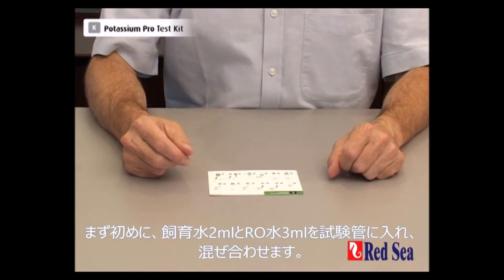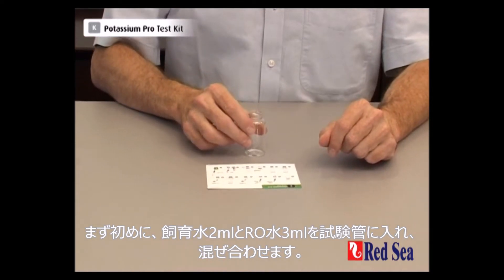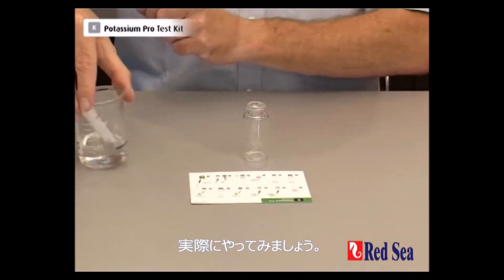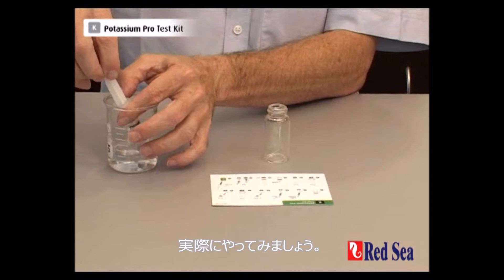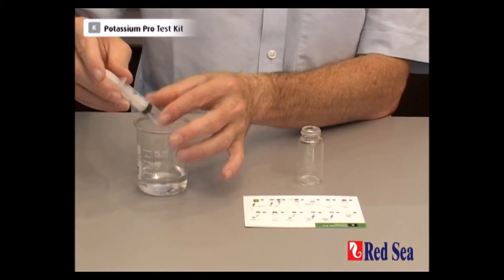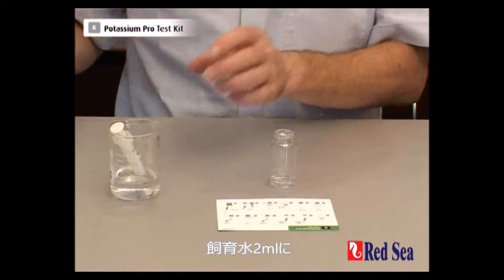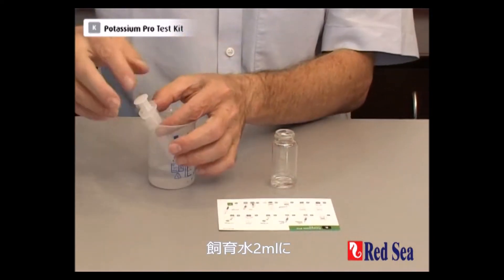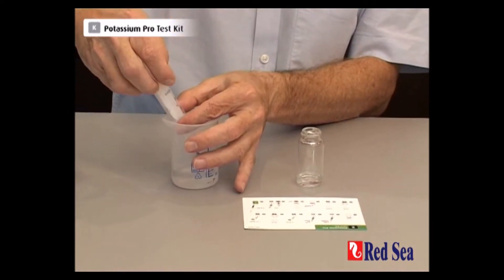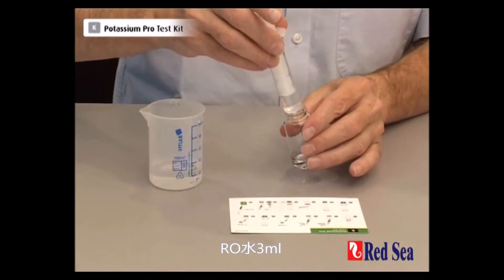The first part of doing this test is mixing 2ml of aquarium water with 3ml of RO water. Let's do that — 2ml of our water sample with 3ml of RO water.